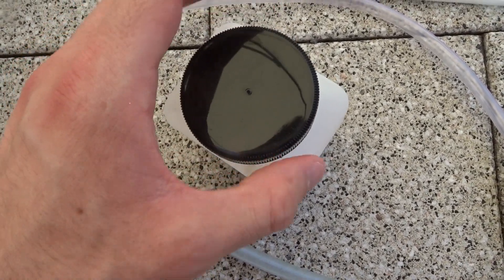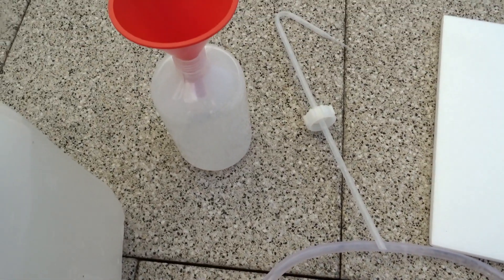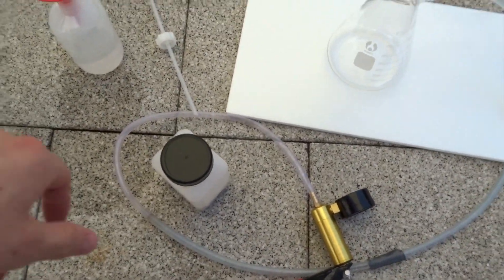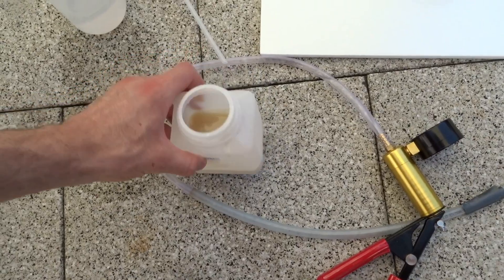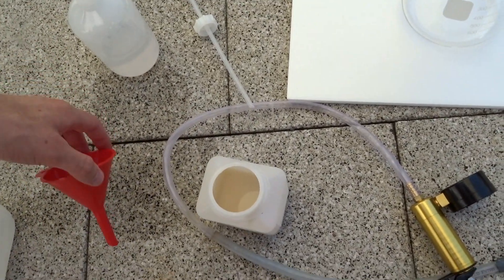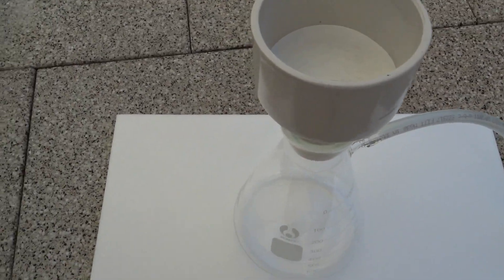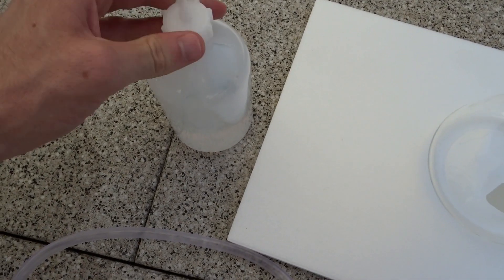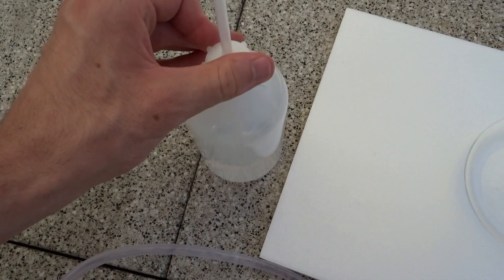This stuff actually stinks quite a lot. First of all I'm going to fill up this covered bottle. So the first task of the day is transforming this goo into a filtering funnel, first assembling the screwed bottle. That will be our main piece of equipment today.